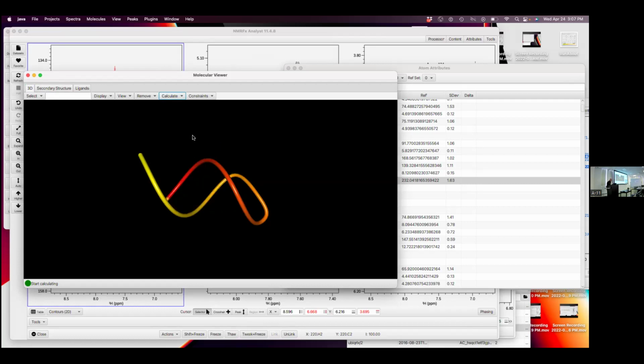If we go to this refined structure with the complex force field, this is better to show on a protein. A typical structure calculation with NMR data is just repulsive, keeping atoms apart except when the restraints are pointing near. We have something that's a subset of the Amber force field, so you can turn that on, though it still doesn't have electrostatics and things that would be really important in RNA. If you calculate a protein structure and then turn on the complex force field, it just kind of shrinks. You'll see it shrink a little bit because now the forces are attractive as well as repulsive.